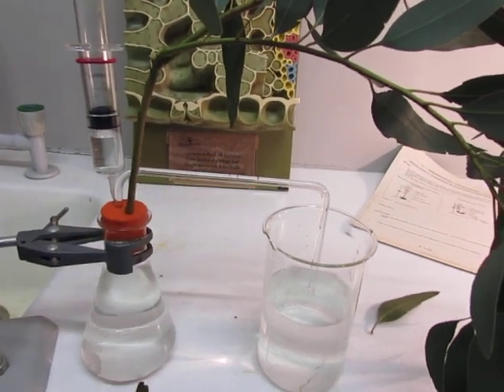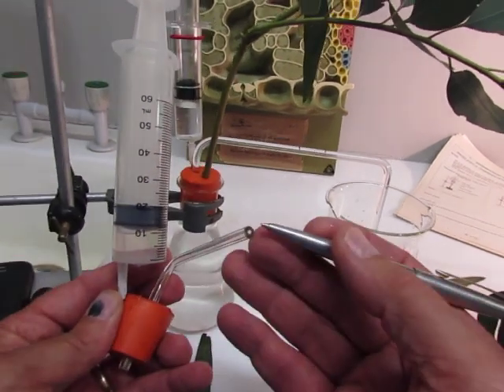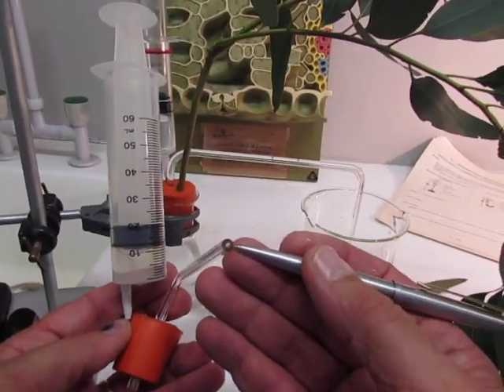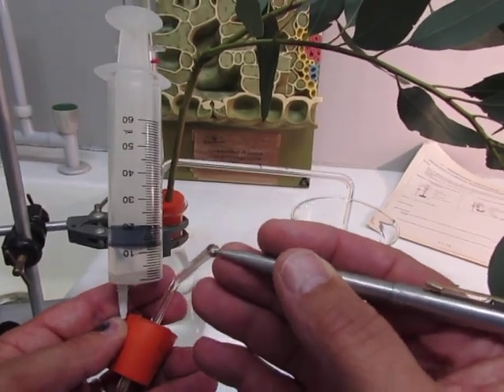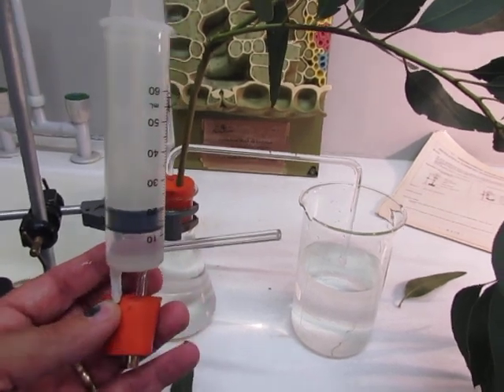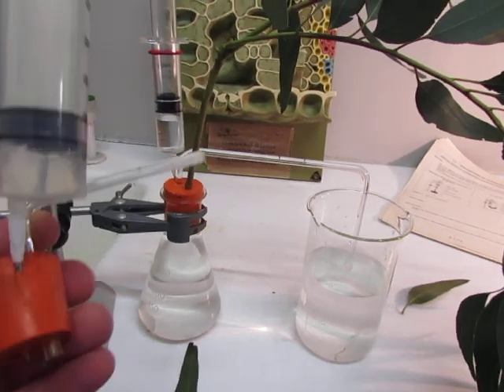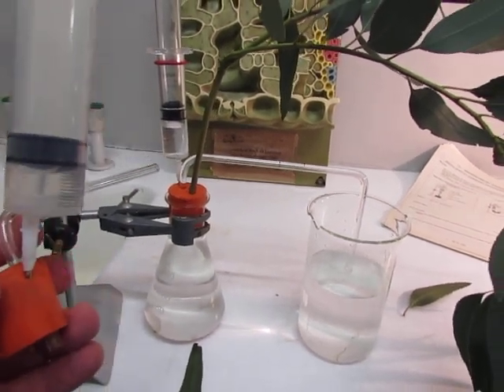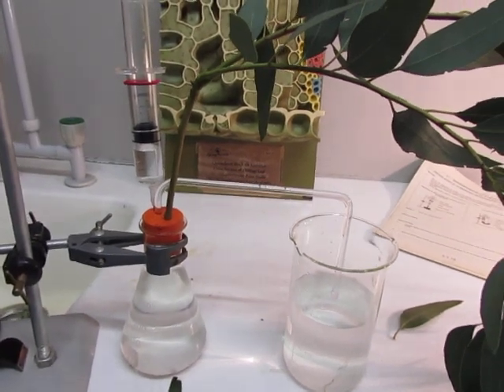Now you might wonder what a capillary tube is. I'm going to show you. A capillary tube is a glass tube with a very thick wall and a very thin hole in there. We want to establish the rate of transpiration very accurately, and that's why we need such a small hole in the glass tube.